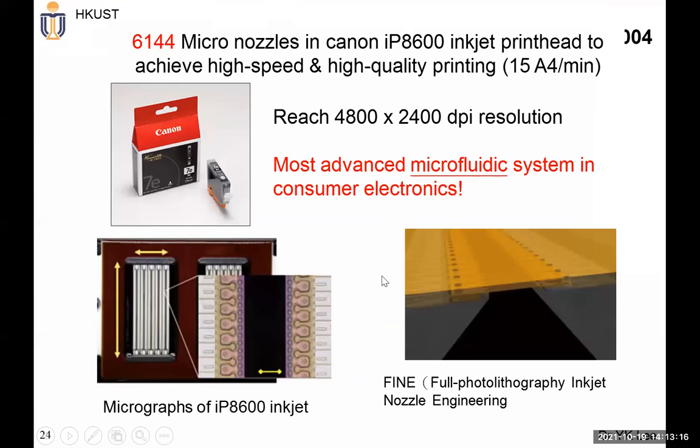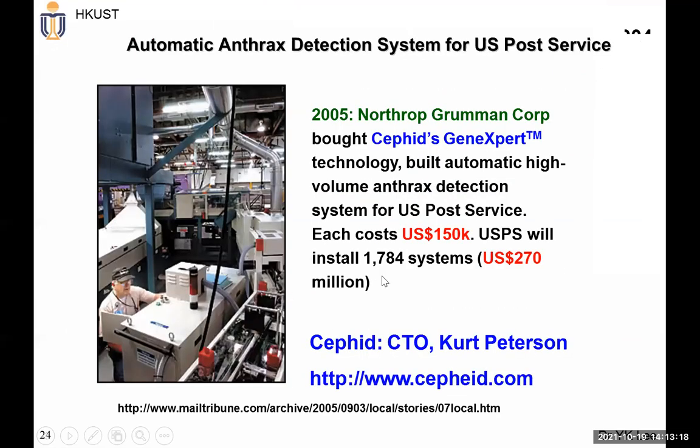That's the requirement, right? Of course, we also mentioned that another branch is microfluidics, for biosensing and medical diagnosis, as we mentioned last time. Cepheid is one company founded by Dr. Kurt Petersen, one of the pioneers in this field, who used to work for IBM Research for many years, and then started a series of companies, MEMS sensors and also microfluidics, micro PCR.